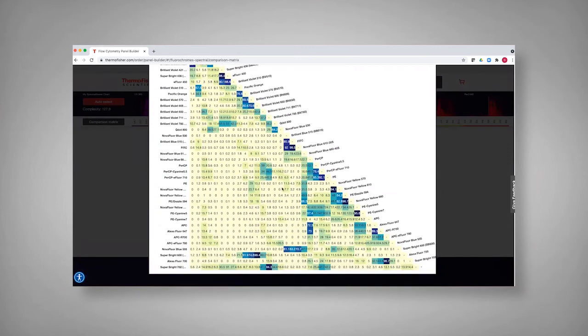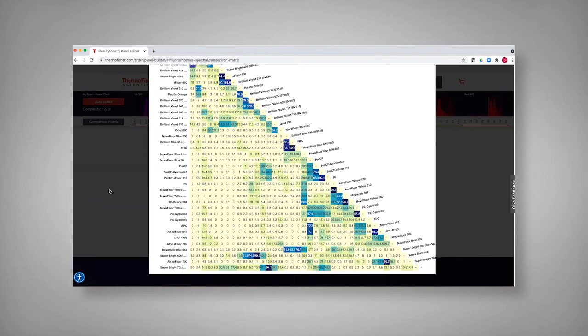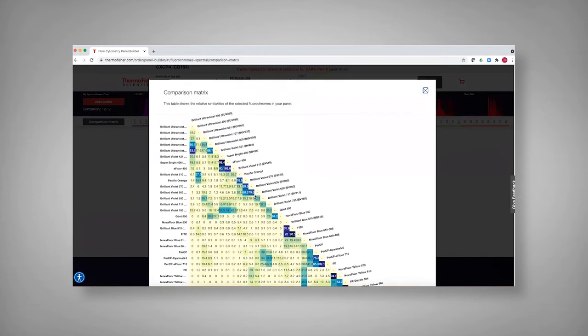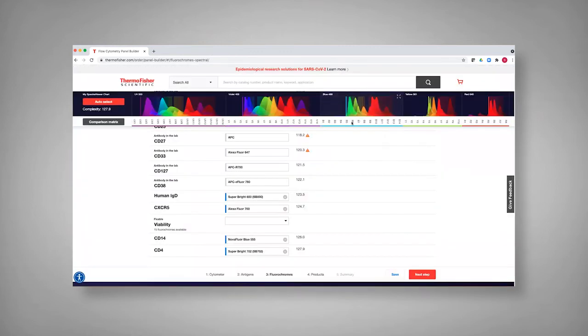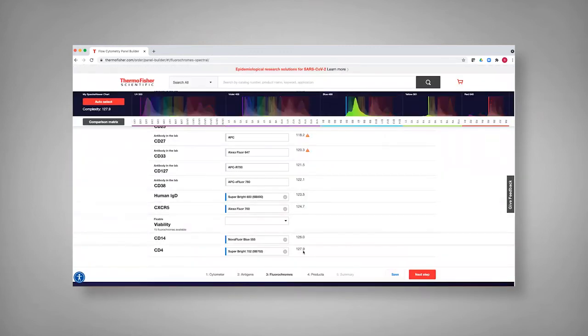And especially as you get into the darker blue, you might switch out some of what's happening here. And in some cases, these have been arranged so that there's not really an issue because these wouldn't be co-expressed, but it's worth thinking about as you're going through the panel design. And so you can see that it's selected for these different dyes.